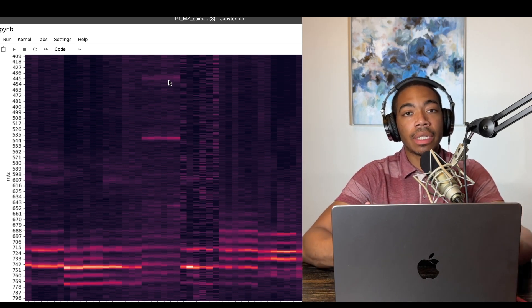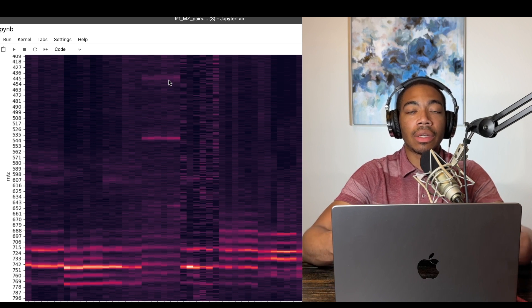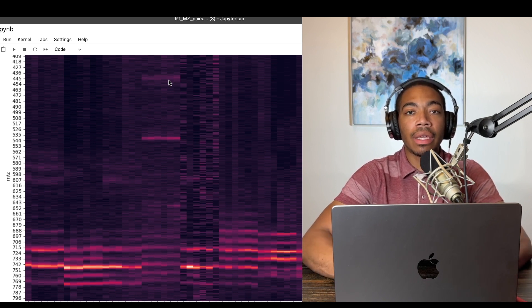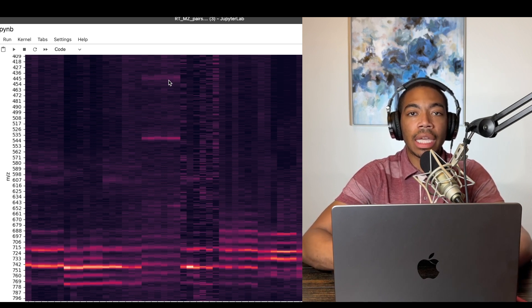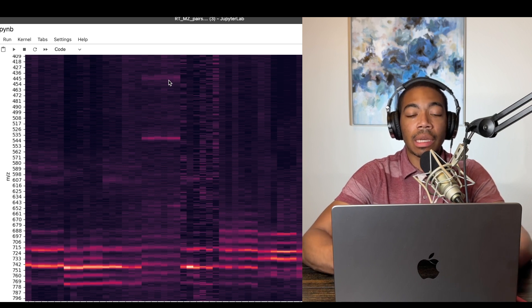And in particular, when you have stakeholders that aren't necessarily interested in looking at all of the chromatograms or mass spectra individually, this is a great way to summarize.